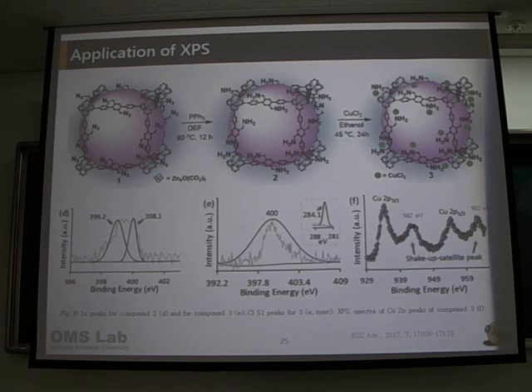Yeah, TGA, I see that the number 3 compound, if we consider the weight loss, compound 1, compound 2, compound 3. Which function? You mean the nitrogen peak, the amine peak, the degradation of which peak? That's what I'm asking. Overall, we know 100, 150, maybe, something like that, but at the final, about 700, 730, in this area, which is corresponding to what degradation? The weight ratio and the temperature. That range, the weight loss is due to degradation of what? Like 700.